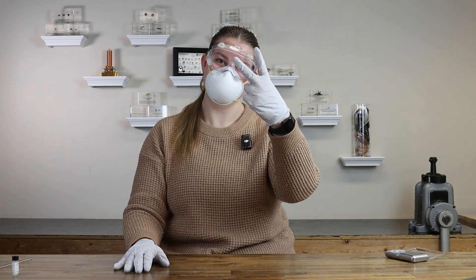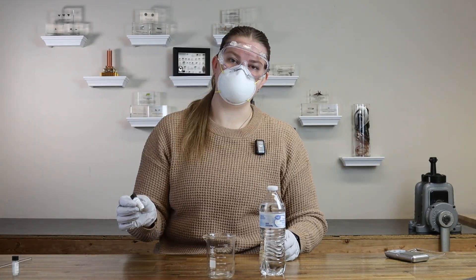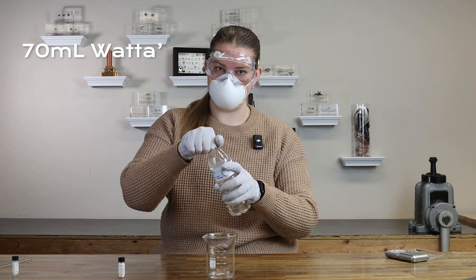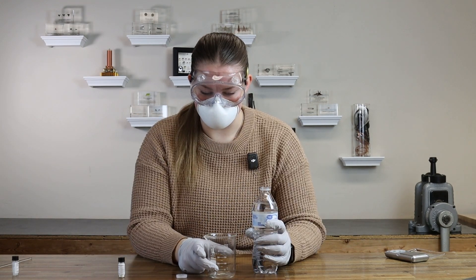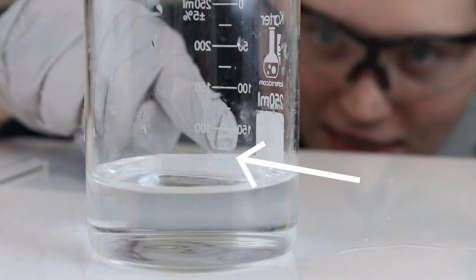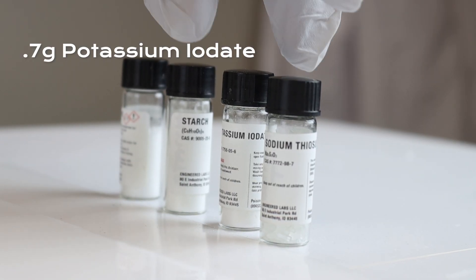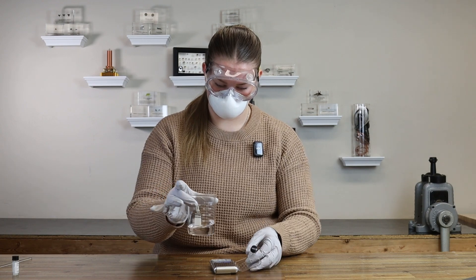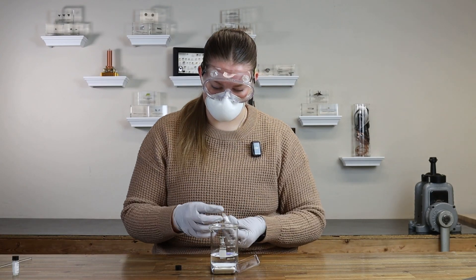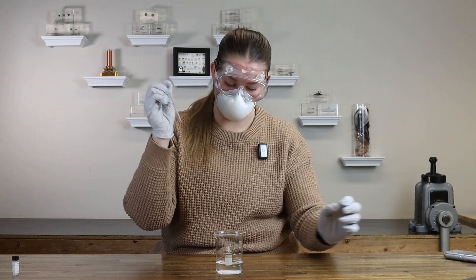Solution B: beaker number two, water, potassium iodate. For this one, we're going to do 70 milliliters of water. On the beaker there's not a 70 milliliter mark, but there is a 75 — I'm going to go just below the 75. Now we're going to do 0.7 grams of the potassium iodate. We do give you two stir rods — use the other stir rod for this one, or else the reaction will happen too early.